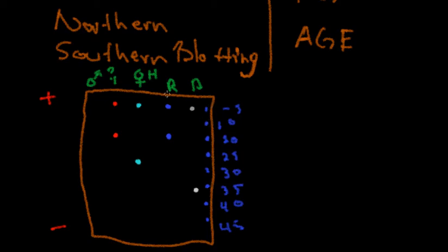Sometimes we're not interested in the ladder. Maybe I'm just interested in knowing species. So if we're looking at various species, I can tell you that this particular sample, my unknown, matches up with the rabbit sample, but it doesn't match up with human or dog, so we know this was a rabbit, just based off the size of the molecule, or at least it suggests it was a rabbit.